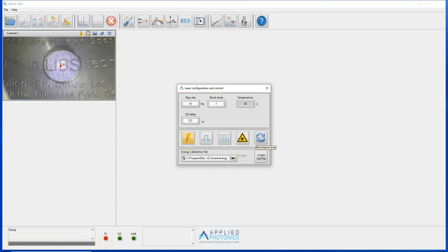During an acquisition, this is done automatically. Under manual control, the pulse, burst and continuous Q-switch controls can be used. So we can fire a pulse, single shot. If we set a burst of 10 shots, or we can set the laser firing continuously. When the laser is firing, the Q-switch indicator on the main screen changes colour from green to red.